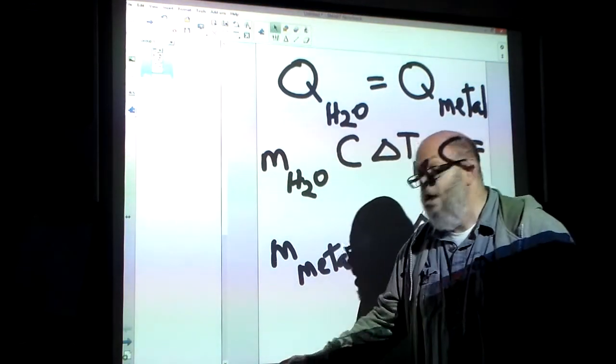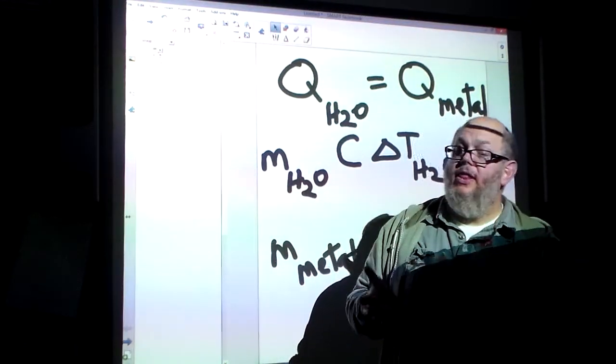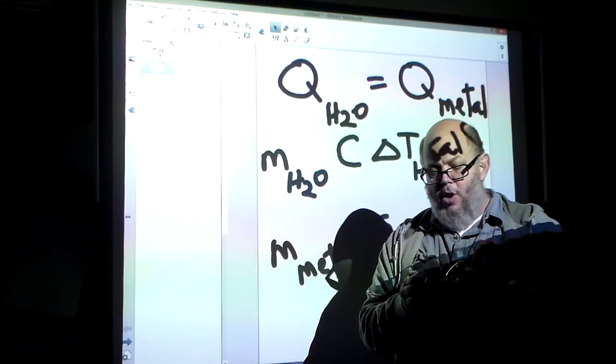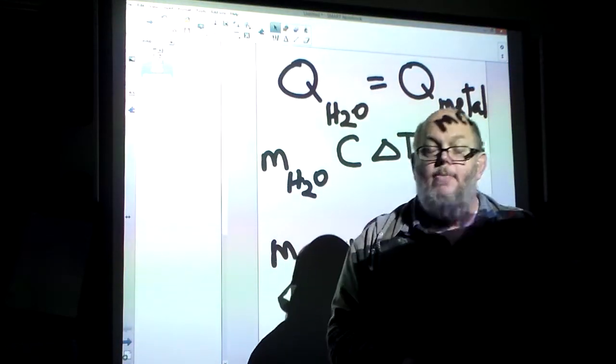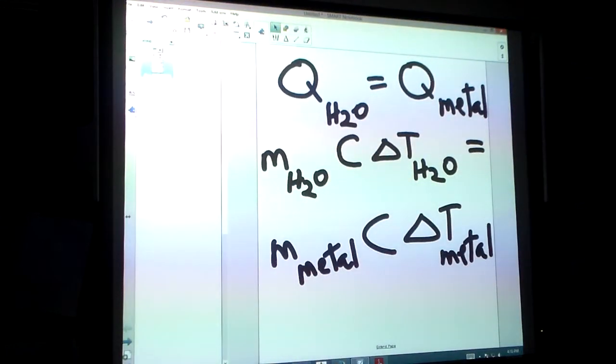All right. So now we explained the theory. Now what we need to do is go into the lab itself. I do not have the ability to stop the video and then go and reset up in the lab. So I'm going to have to make this one video, one shot. Okay? So we're going to move over to the lab next.